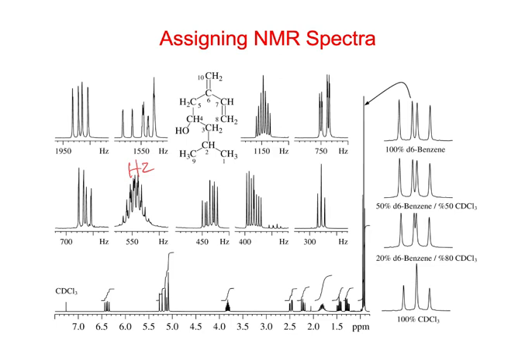I mean, around 4. Yeah, but even squinting at that doesn't look right. No. Because that's CH2. Oh, could it be? I guess would it be around 5? Yeah, it's probably one of these ones around 5. Okay, so we have around 5.